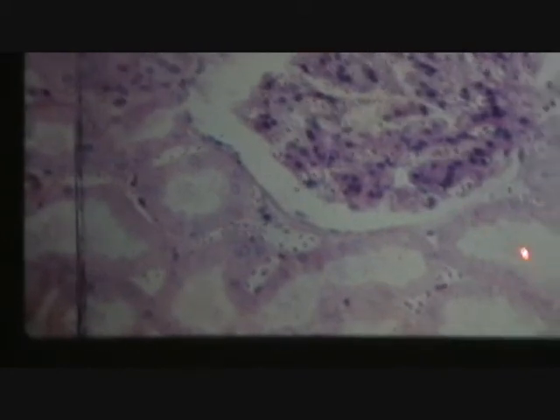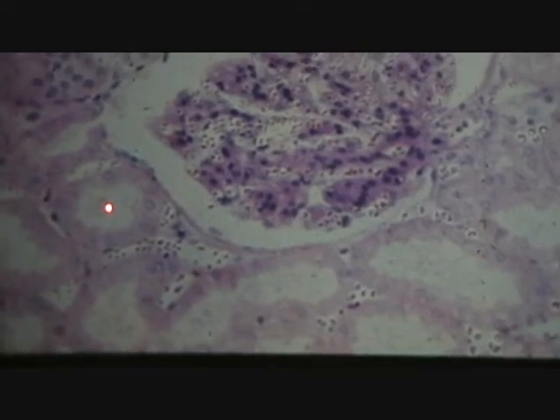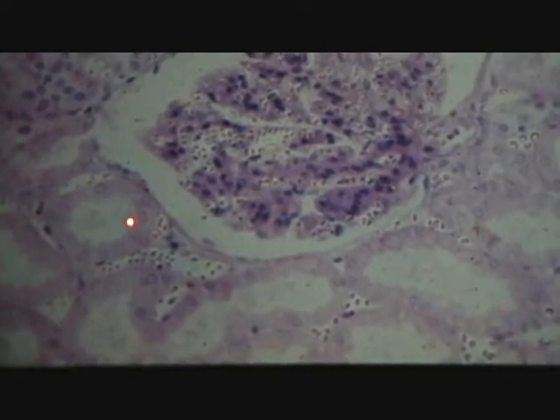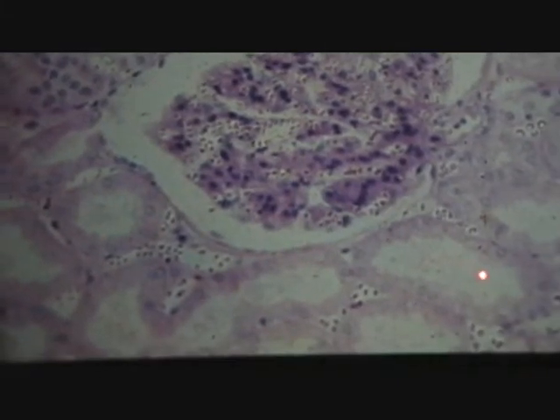You could do the same thing here. Say this one compared to this one. That's got to be a DT, more elongated, more circular, got to be a PT. Proximal versus distal.